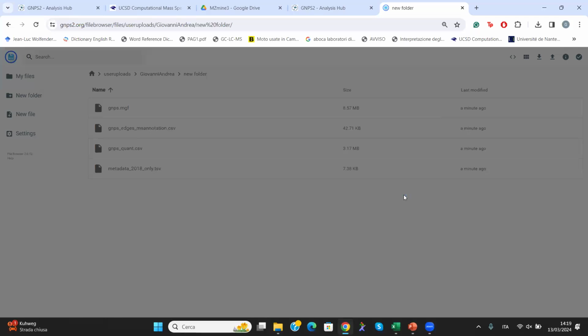If you want to use the raw data in the same way, you can drag and drop the raw data. You can also do that. Of course, it will take more time, but you don't have to use WinSCP or this kind of thing, so it's a bit more immediate. I don't know what the capability of this is, but I did it with the raw data from this workshop and it worked. It took a bit. That's something that you can also ask Ming. But I found it really useful.